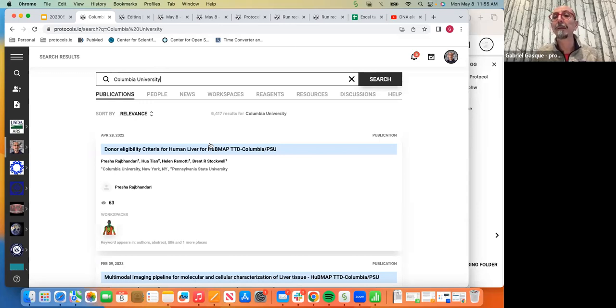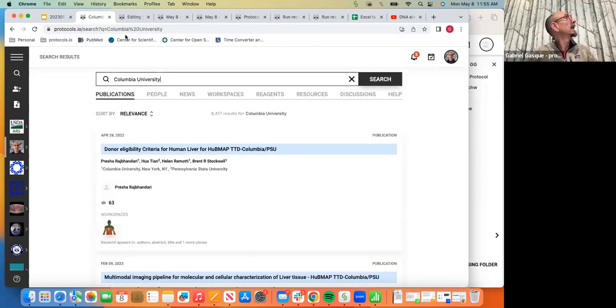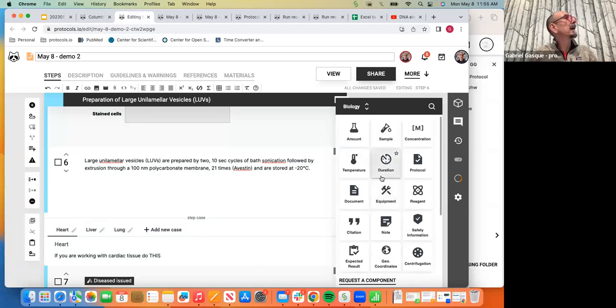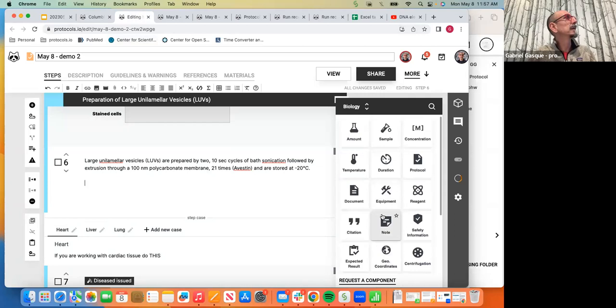Let me know, Marlena, if I am answering your question. And you are asking if you can edit reagents once they are created. To be honest, let me see if we can do that. So let me go back to editing. I'm going to insert a reagent here in a step 6. Where is reagent? Reagent.